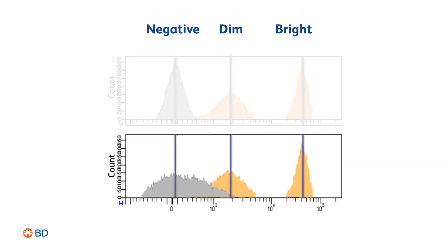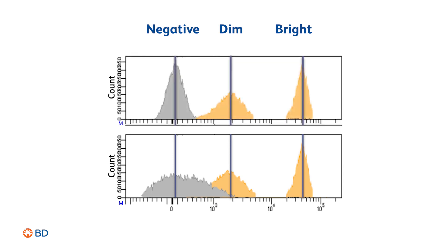Here, in the bottom panel, the spread of the negative population is coming from spillover from a different fluorochrome. This effect can be problematic as it makes population resolution harder to achieve.